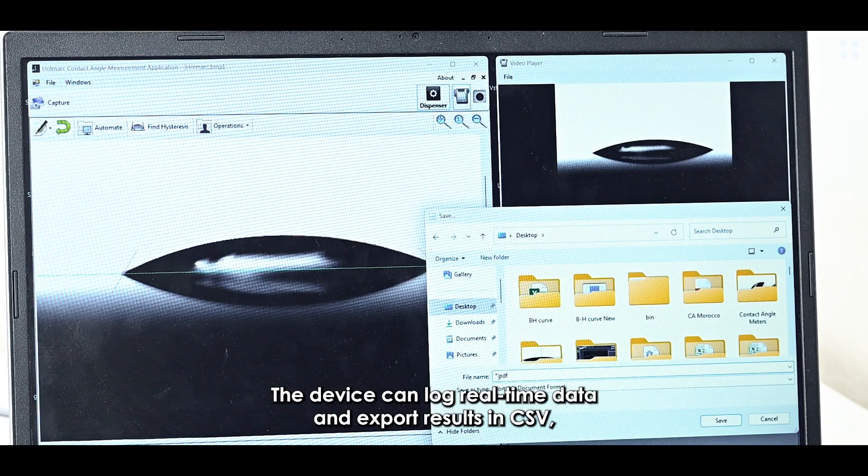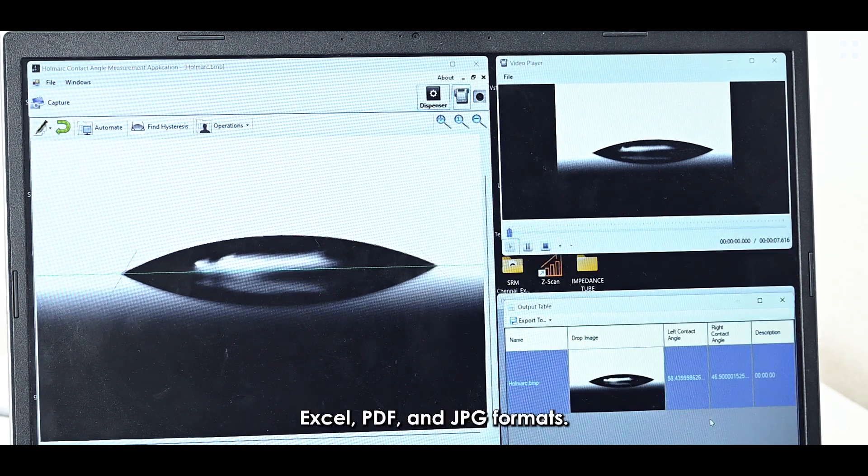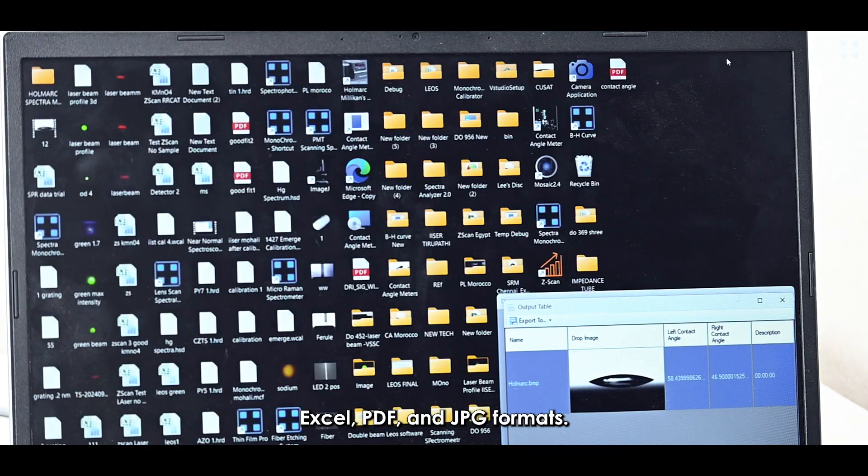The device can log real-time data and export results in CSV, Excel, PDF, and JPG formats.